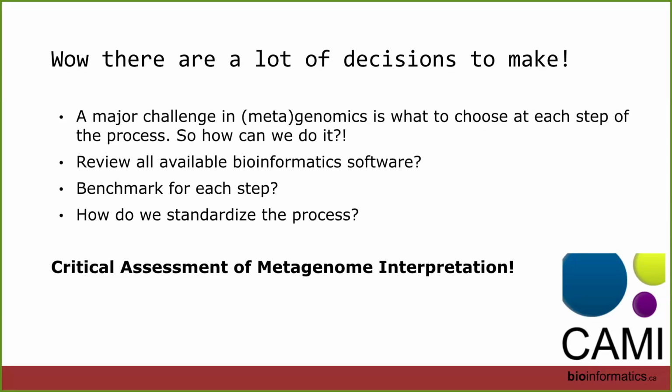And they are a group, not the only group, but a good group that has started really trying to get at benchmarking and comparing bioinformatics software, specifically for metagenomics. So when you have questions of which assembler should I use for my environment, you can start with some of the publications and some of the data that CAMI has provided. And I'll show you some of the data, but I'll also tell you where you can find that data, and those in the publication.